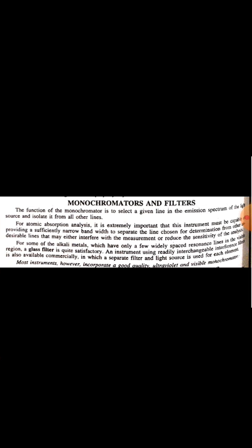A common monochromator is of 1 by 2 m focal length with a linear reciprocal dispersion in the range 16 to 35 angstrom per millimeter. The function of a monochromator is to select a given absorbing line from the spectral lines emitted from the hollow cathode. The next components are the detectors.